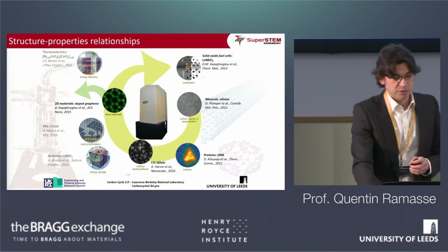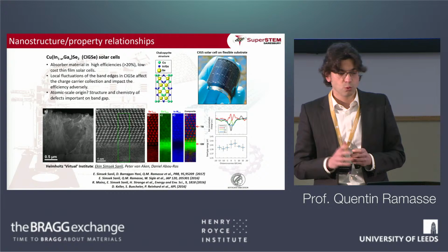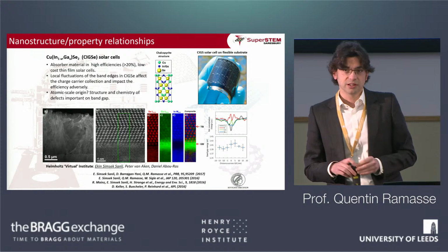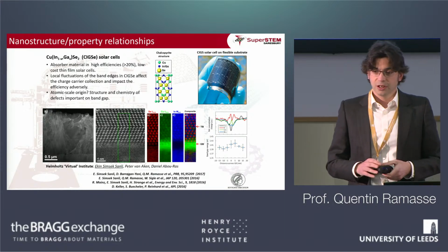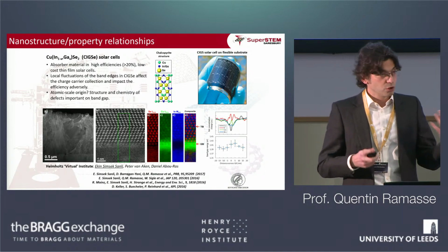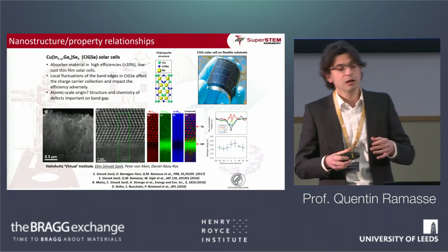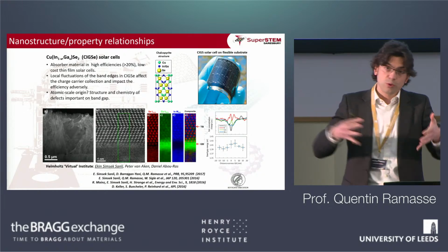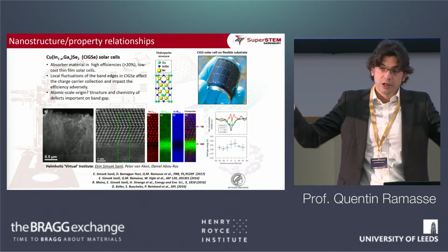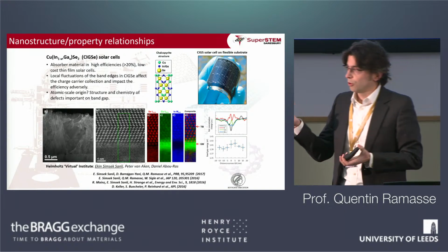But let's start with a few applications, in particular on the energy materials side of things. And this is basically just a one-slide summary of all you can do with one of these machines. There's a whole bunch of paper that was a PhD project for one of our students, Ekin Shimshek, who was looking at copper indium gallium selenide absorber layers for photovoltaics, from essentially what is bulk all the way down to the single atom. And I think this particular example encompasses how you can go from even device-sized samples all the way down to the single atom.